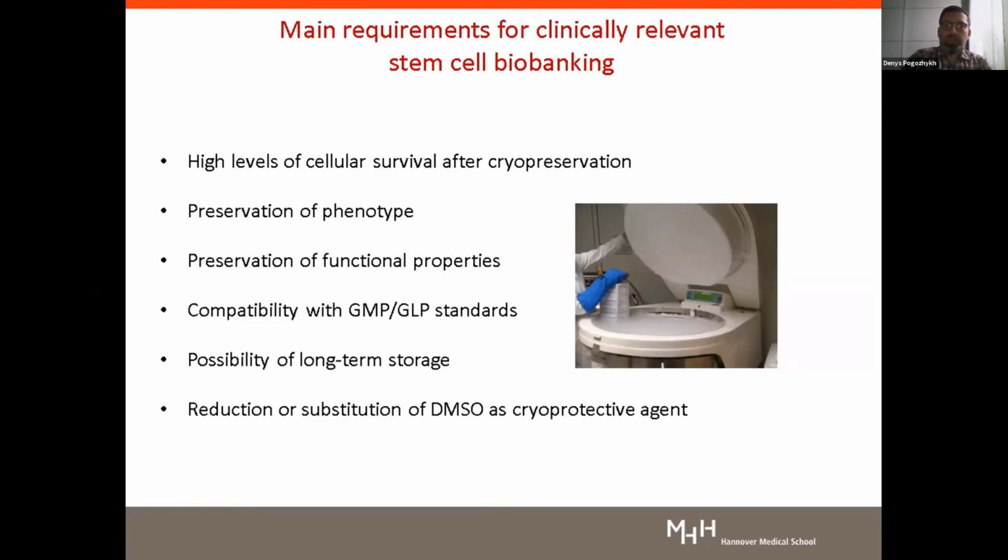Also, there should be a possibility for long-term storage. Yeah, for example, Birgit mentioned, in the -80 fridges we cannot store them for so long. Yeah, but if we need them in years or decades, this is a very important issue, and this is what I will address in the further talk. And there are, of course, debates about the reduction or substitution of DMSO as cryoprotectant. There has been a lot of nice information covered about it. Yeah, and Dr. Elliott also mentioned the balance between toxicity and effectivity of cryoprotectant, which has to be taken into account. Yeah, so these are all very important aspects.